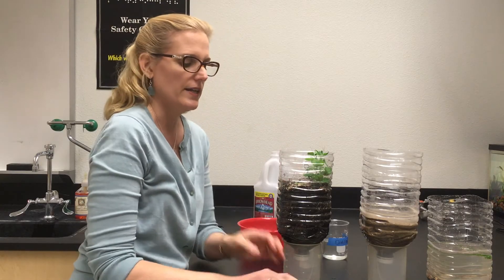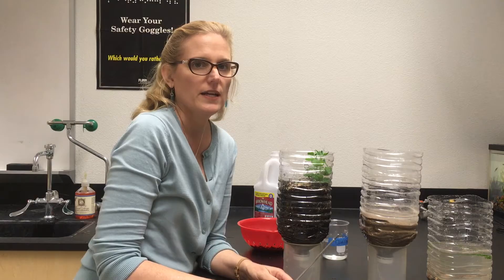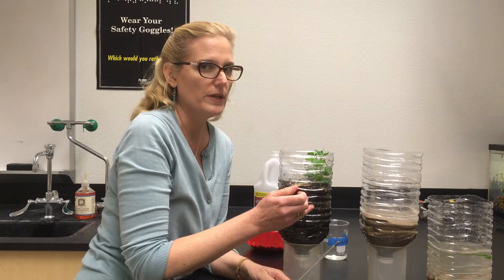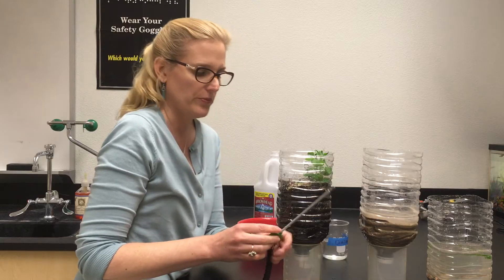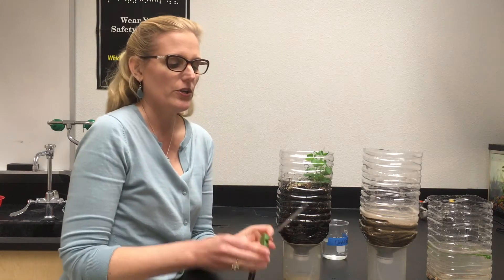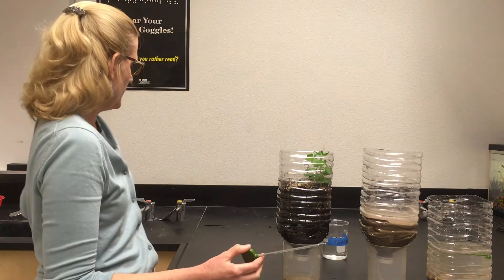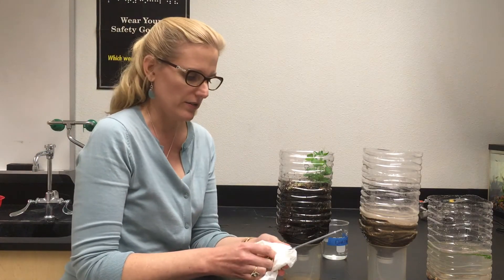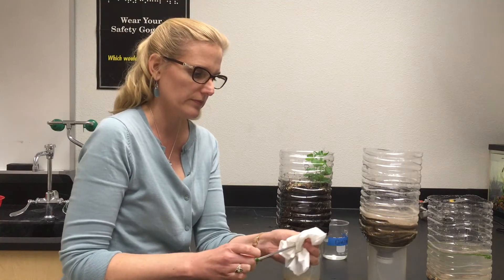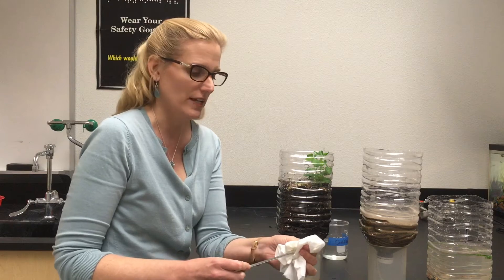The reason for this is that this probe measures ions, and the ions in the soil need to come out into the water in order to be picked up by the probe. After our soil is thoroughly wet, we're going to take the probe and, with a dry paper towel, rub the probe. That's to loosen any oxidization that has occurred.